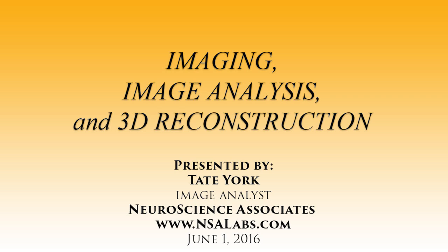So with all of this equipment, we're able to provide bright field whole tissue scans at 10 and 20x using our scanning system from Objective Imaging. We also have manual scopes that we can use to take more specific images of your tissue in bright field and fluorescence. We have objective lenses ranging from 2x all the way up to 60x, which is our oil immersion lens.